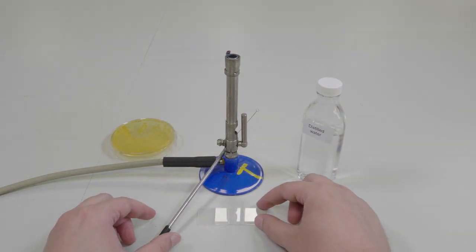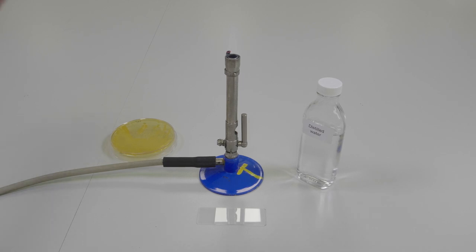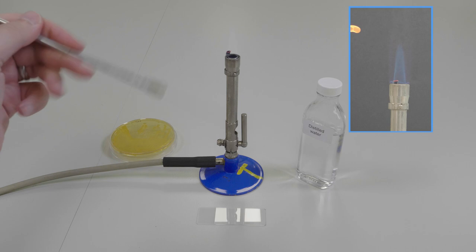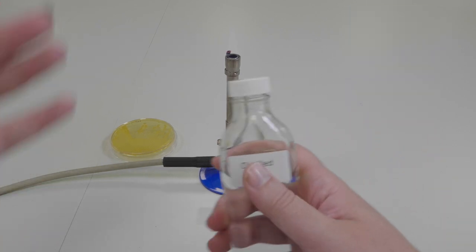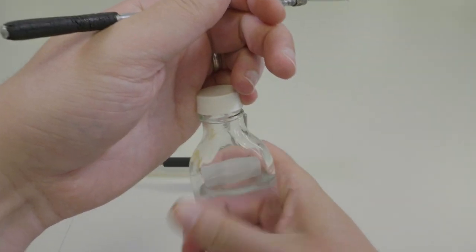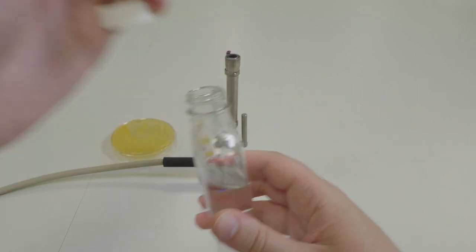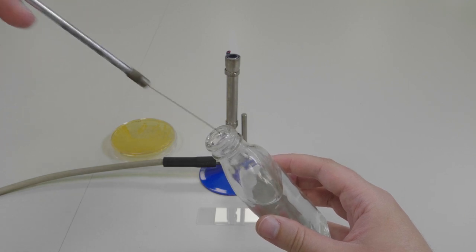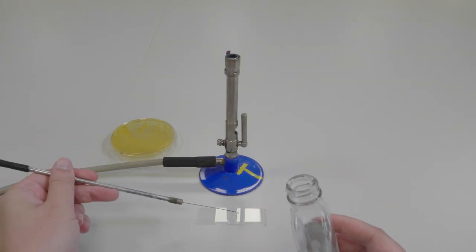Next take your inoculating loop and sterilize it. Take the lid off the distilled water using the little finger of your dominant hand, flame the neck of the water bottle and place three loopfuls of water onto your microscope slide.